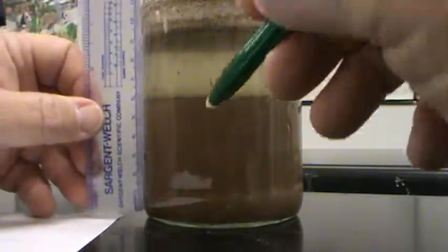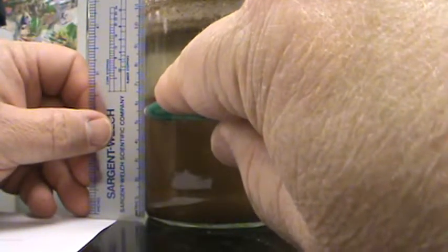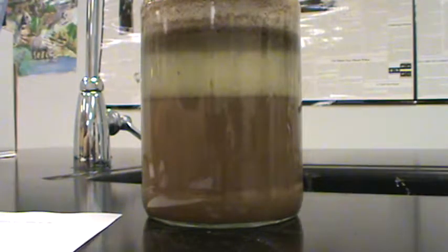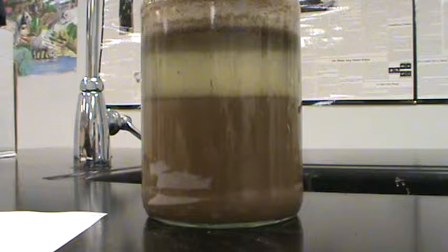Then we have the depth of the silt. The silt's going to be from about 4 to 5.5. So the depth of the silt is 1.5. And then the depth of the clay would be 0.5 centimeters. So now we're going to do some calculating and figure out the percentages. And percentages are really very easy to figure out if you know how to do it.